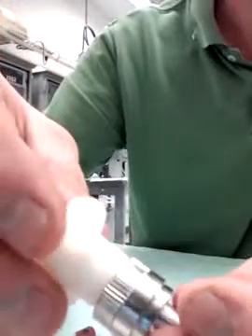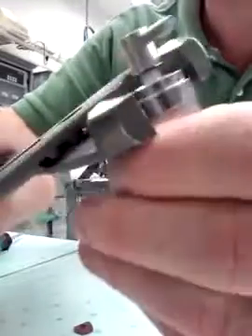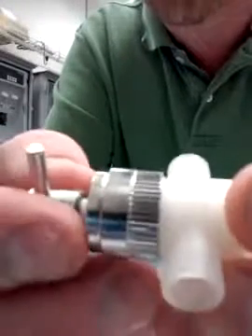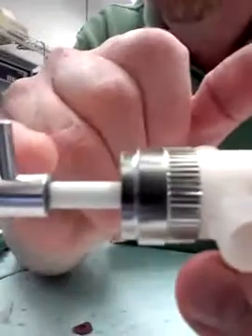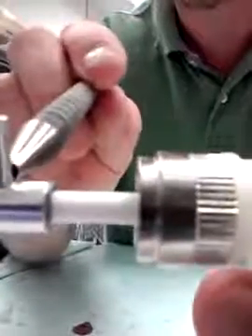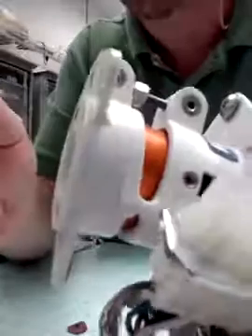Insert the head all the way down. Tighten it finger tight, then grab your channel locks and give it about an eighth of a turn to get it tight. The next thing is to pull this out about three-quarters of an inch, measuring from the inner part of the L-shaft to the top of the locking collar. Then reinsert into your pump and that's it.